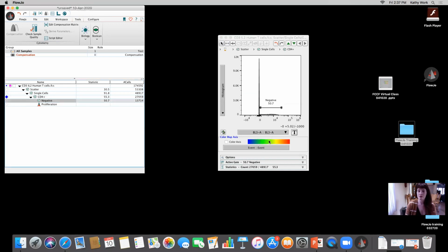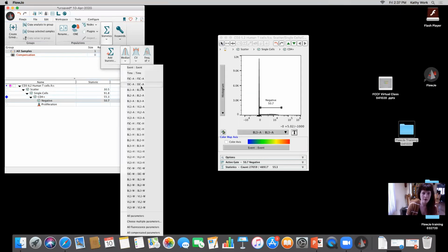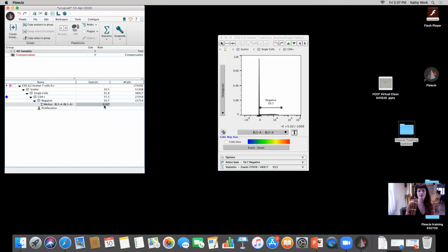What I can then do, if this was the channel that I was using for my proliferation, I can come into workspace, statistics, and I can go to BL3, 6,187. It's a very high number because that's not really what we're looking at here, and I'm just showing a mock-up. And then I can fix that background at 6,187, and the modeling software would understand that it needs to be above that value to be considered positive for that proliferation dye, if that makes sense. It's not a great example for me to be working from, but just to give you an idea.